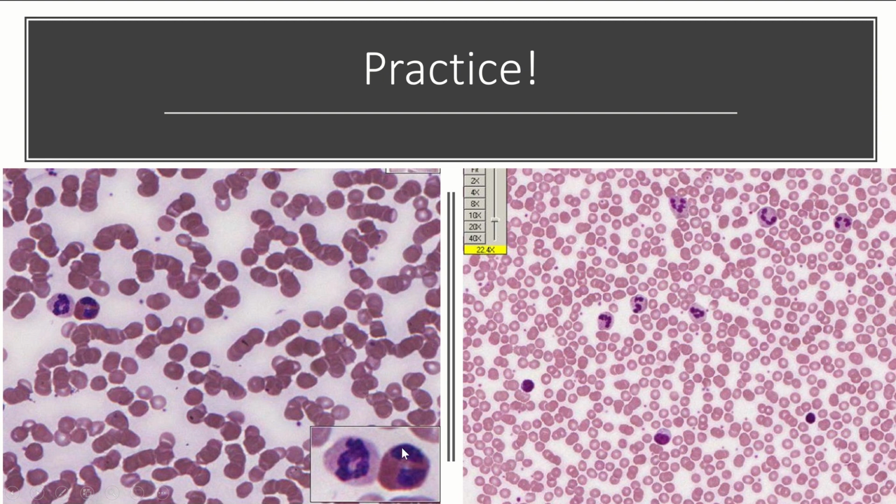Eosinophil. Okay. And here's another trick to help me remember this: remember when we learned about the stains, we said that eosin stains proteins red, right? Eosin is the part of H&E that stains proteins red. So eosinophil means eosin loving. So it loves the stain eosin, so it's going to stain very red. Okay. And then hopefully you can appreciate that it kind of looks like there's two nuclei in here, right? But really we know that that means that it's bilobed, and eosinophils are very commonly bilobed.